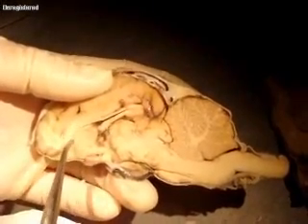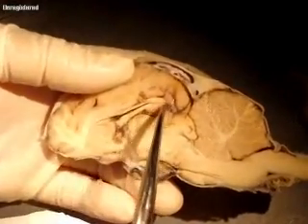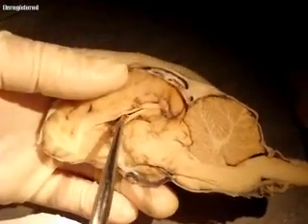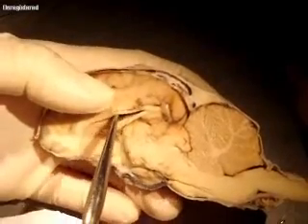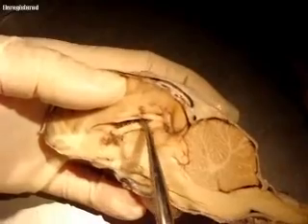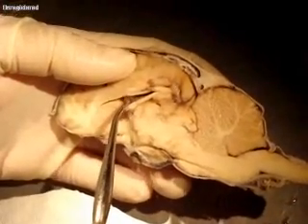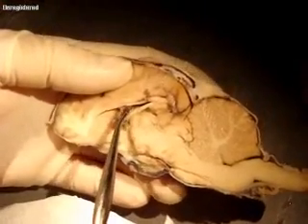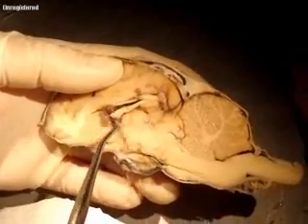It's a commissure. This is all corpus callosum at the top here. There's a little lip at the bottom, and that lip at the bottom is called the fornix. The corpus callosum is the roof of the lateral ventricles, and inside the lateral ventricles there are these blood vessels, and these are some of them right here, that produce the cerebrospinal fluid, and they're called the choroid plexus. And you'll see that that blood vessel comes all the way around these lateral ventricles.